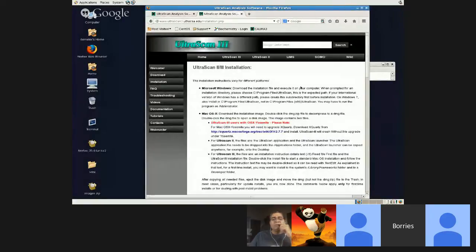After you installed the software, you need to register it. There's just a registration dialog that will pop up. You just fill it out and click register, and then you'll receive a link that you need to confirm in your email. And then when you do that, you can open up the registration again and confirm your registration, and then it should work.